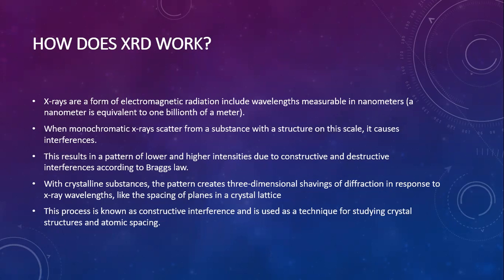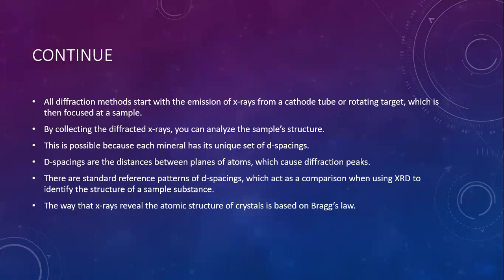With a crystalline substance, the pattern created is a three-dimensional set of diffraction peaks in response to X-ray wavelengths, like the spacing of the planes in the crystalline lattice. This process is known as constructive interference and is used as a technique for studying crystal structure and atomic spacing.